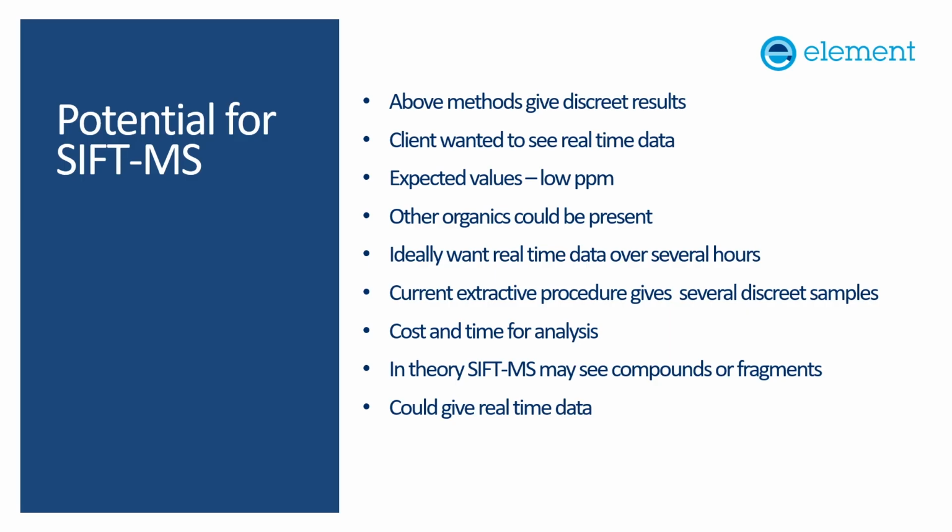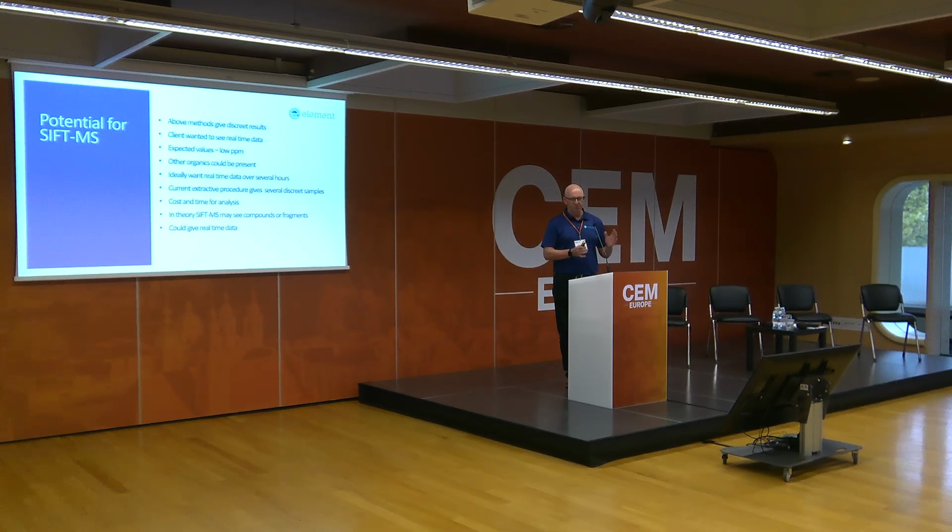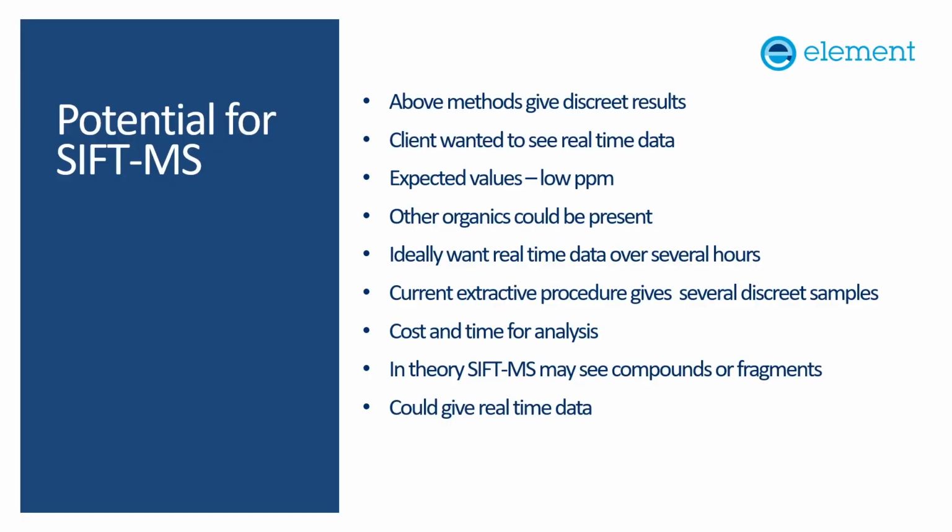Mentioned the extractor procedure. We could have done several discrete samples, and we did that, albeit not following the OTM methods, using a bit of a simpler method, just impingement into water to see what results they gave. It's probably more linked to the standards that the lab already worked to, using water analysis samples and standards. And then there's obviously a cost to doing those samples, as well as a time element when you take the samples before you can get the results.